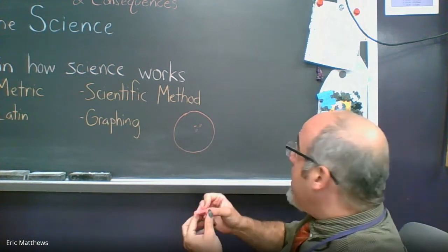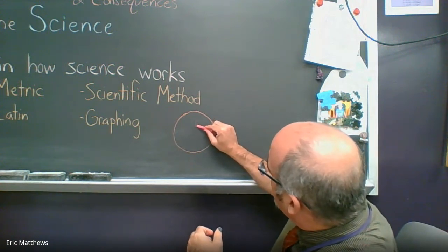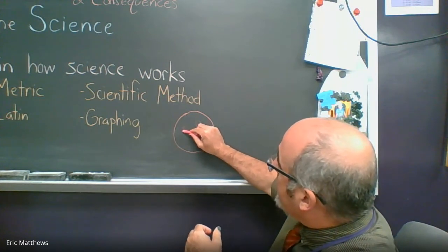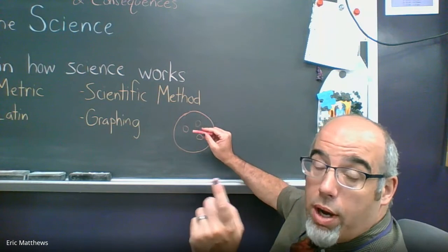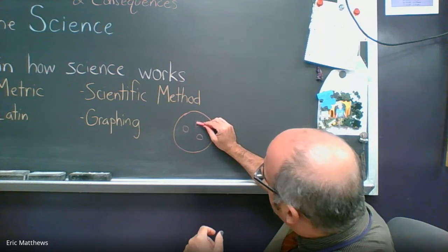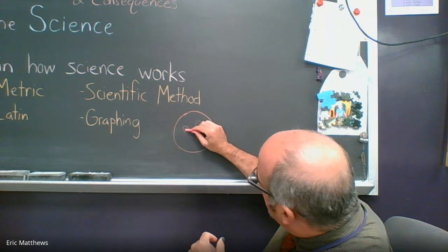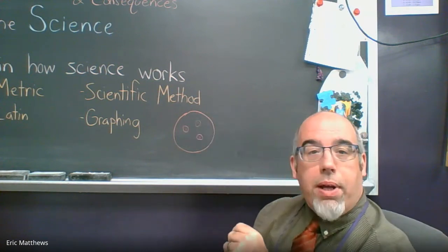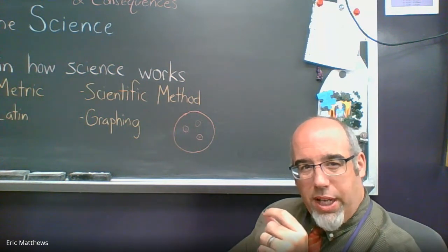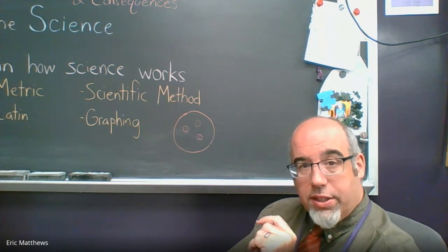You clearly didn't brush after breakfast, or dinner maybe. Now, once you go up to medium power, these are going to get a little bit bigger. And you're going to be able to see more detail. Namely, what we want to look for is they should be a light yellow gold. And we want to look for a nucleus, which would be a very faint shape on the inside of each one. I realize that you guys probably can't see that too well. It'll look kind of like a bullseye, just a little piece on the inside that's a little bit darker than the rest of the cell.